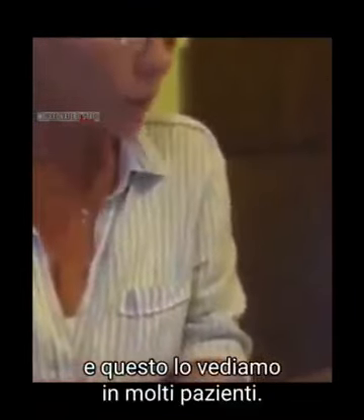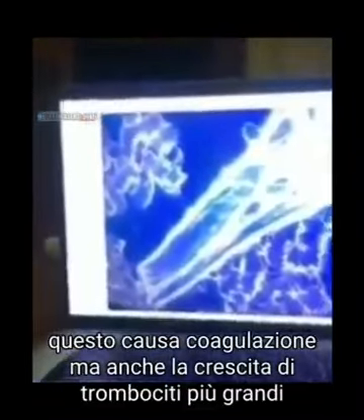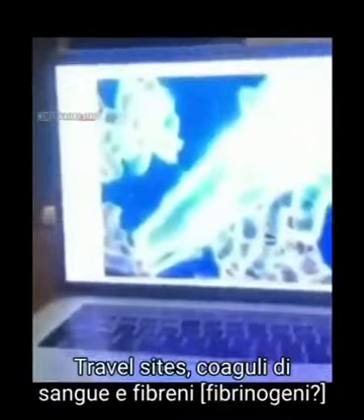Can you define coagulation for people who don't understand it? What does coagulation mean? So at one point you get blood cells like this, that they come out and stuck all together. Yeah, this causes coagulation, but also the build-up of bigger thrombocyte clots, and fibrin.